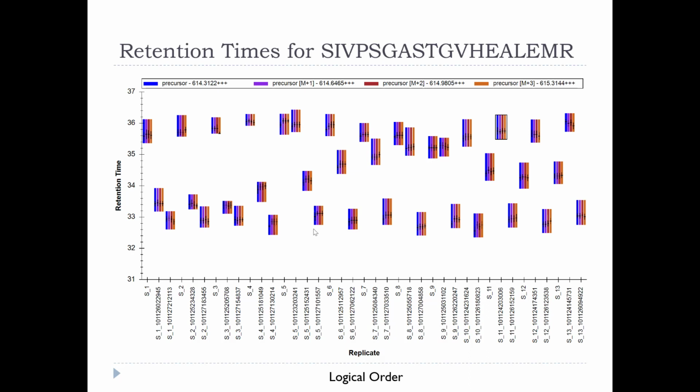So we could go around and around and come up with ideas and write them all down, and I've seen people do this with statistics, where even Jared Eggertson in our old lab was going around with these statistics, and I finally said, look at the chromatograms. What's going on with the chromatograms? And the whole thing turned out to be that the data had carboxymethylation, and we had our experiment set up to look for carbamidomethylation on the cysteines, and that was the end. But you had to come down from the statistical level of looking at things.